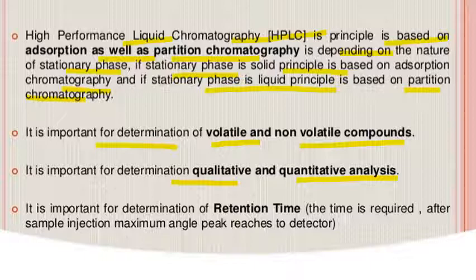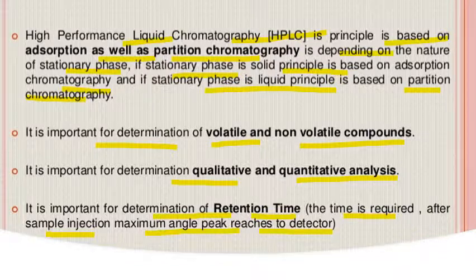It is also important for the determination of retention time, the time required after the sample injection for the maximum peak to reach the detector. So retention time in the column, we can determine it. We can do the qualitative and the quantitative analysis. So it is helpful for both types of compounds, for purification, identifying, or separation, that is volatile as well as non-volatile compounds.